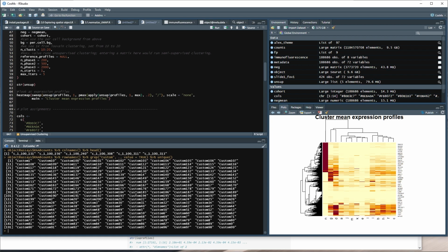so you can have potentially more resolution for a particular gene aside from what NanoString has provided. Or, since there are only 6,000, you can have probes for something else. So for example, if they don't have, they should, but like TP53, you'd be able to add a probe for TP53 and get that resolution for some malignant cell population in your samples. But yep, let's make sure. I believe it's in the background now.